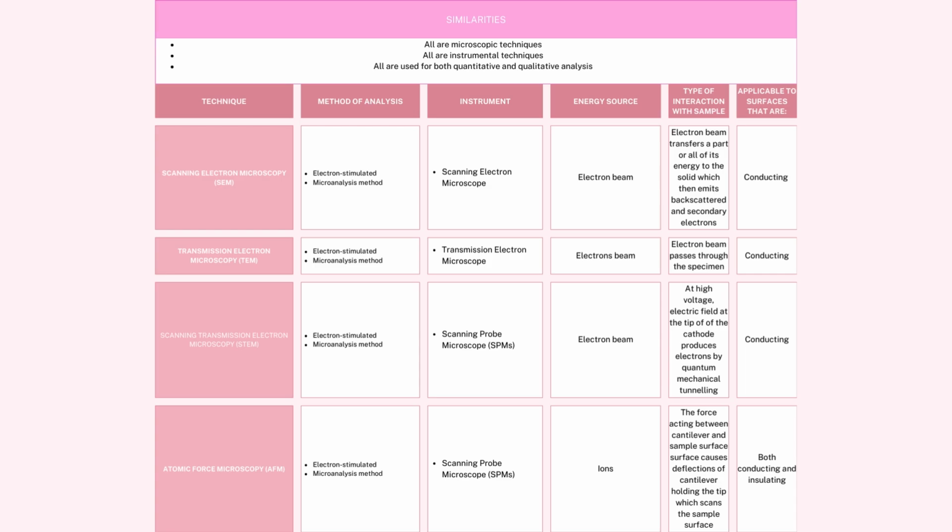Lastly, for the applicable surface, scanning electron microscopy is conducting, transmission electron microscopy is conducting, scanning transmission electron microscopy is also conducting, while atomic force microscopy is both conducting and insulating.